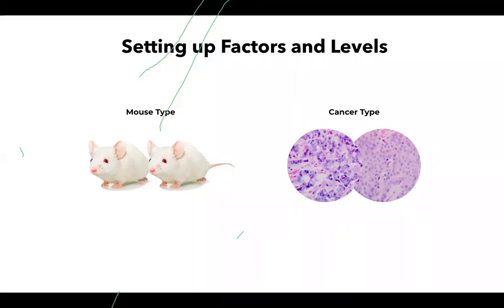So here, 2 different types of mouse. The microenvironment of the tumor would be different, and that could impact our results because we are looking at different models. The different mouse models, such as SCID versus athymic nude, might affect the gene expression of the tumor, right? Therefore, we will perform a factor analysis with breast cancer subtype as a factor and PDX mouse model.